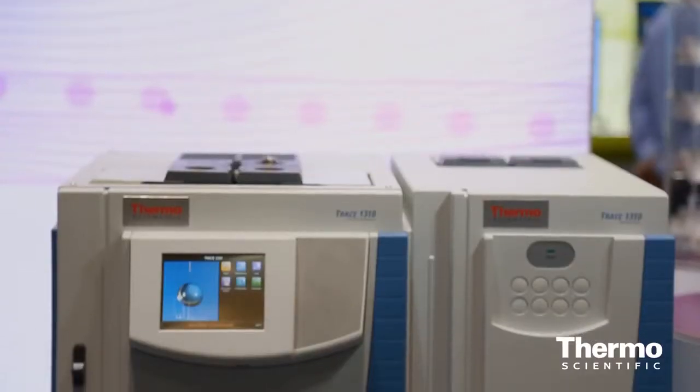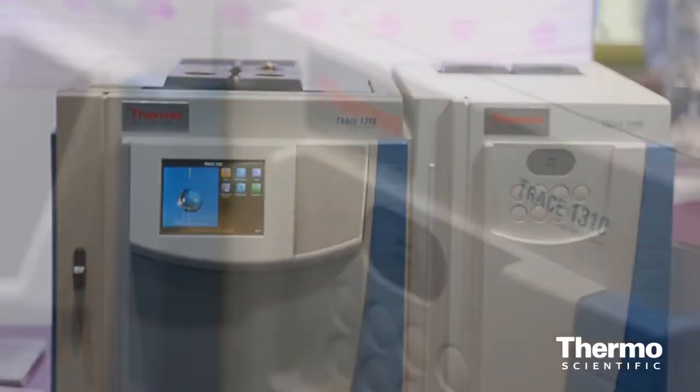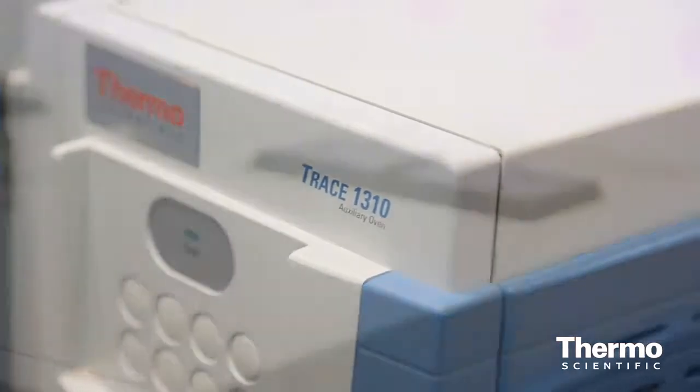Today we have great news for our GC product line. We are introducing the Trace 1300 auxiliary oven for the Trace 1300 series GC. This additional part of the product line would really complete the offering and the solutions for the chemical and petrochemical and gas analysis.